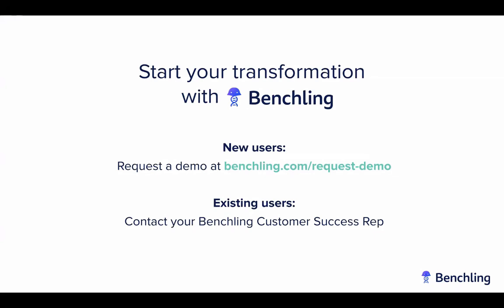One of the first questions was, does Benchling have an API? That's a great question. We showed bringing in data from files, and that's often the case. People are exporting them from design tools that they use. And we also have an API to allow you to upload all the sequences that you work with. The rest of this answer is going to actually answer a couple of other questions.